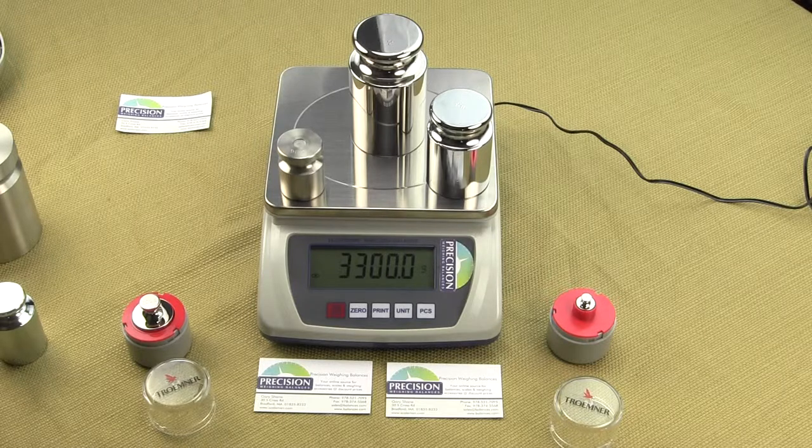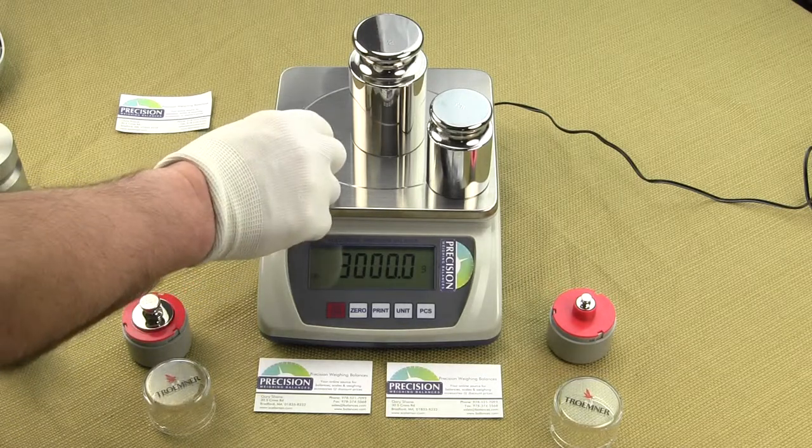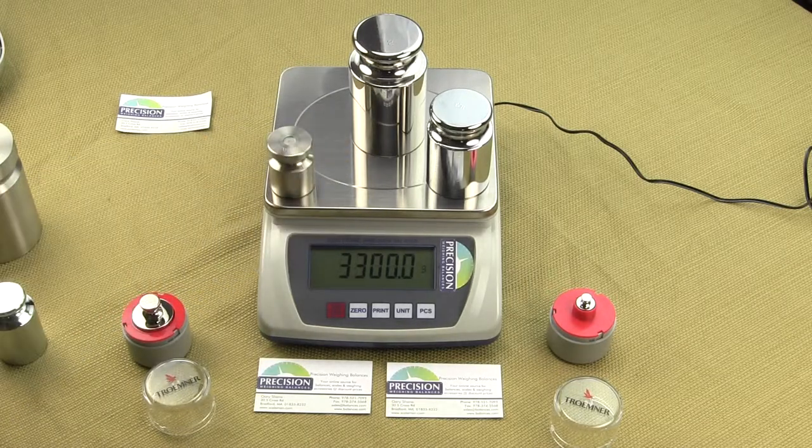We also offer the EPB6K and EPB3K, which are 3,000 grams and 6,000 grams in weighing capacity and still 0.1 gram readability. The features demonstrated in this video are available in all three models. By far, the EPB10K is our number one seller since the price difference between the models isn't that much.